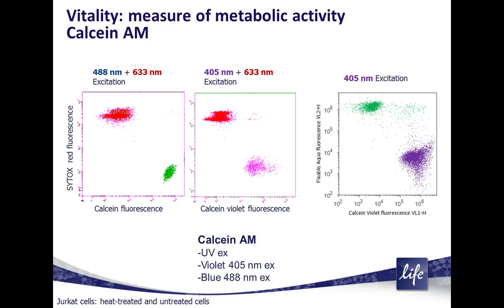Modification of the carboxylic acid with AM ester groups results in an uncharged molecule that can penetrate cell membranes. Once inside the cell, the lipophilic groups are cleaved by nonspecific esterases, resulting in a charged form that is retained in the cells. The calcein AM ester is colorless and essentially non-fluorescent until hydrolyzed. The cleaved calcein is well retained within live cells and produces an intense uniform fluorescence.